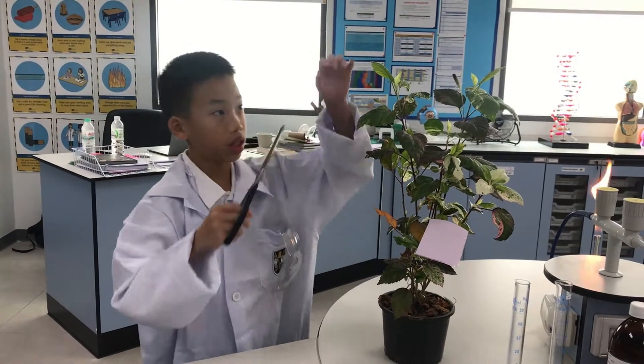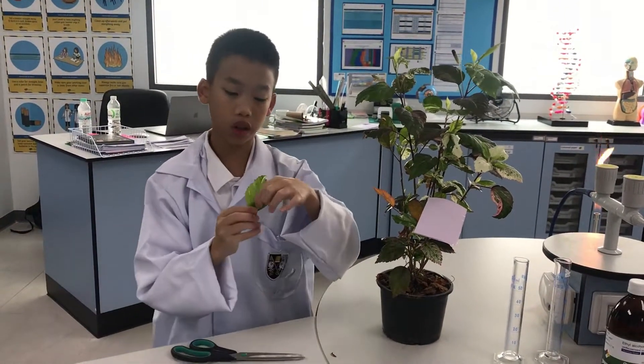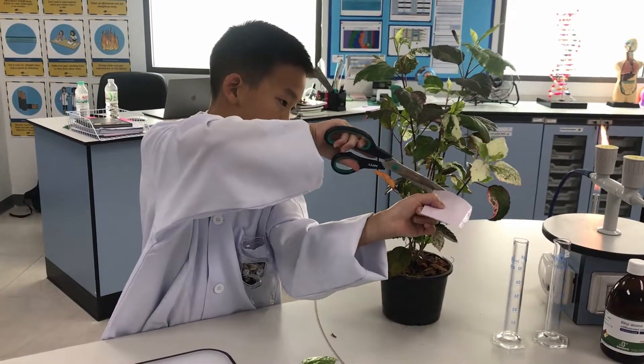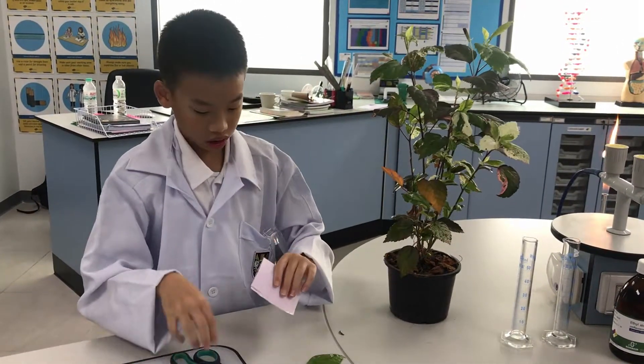Now we'll cut one leaf that is exposed to light and cut one leaf that is put in the dark. This step is quite easy, so we don't need goggles because it's safe.